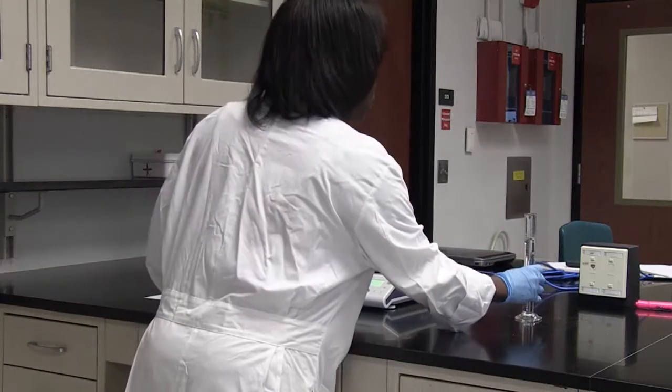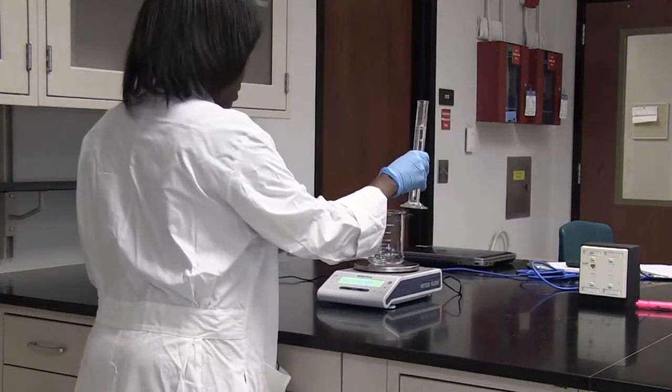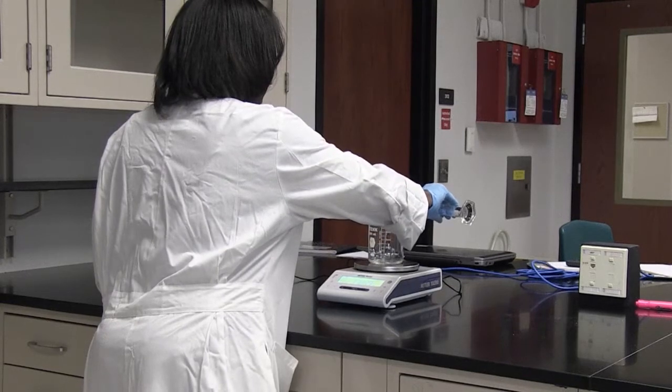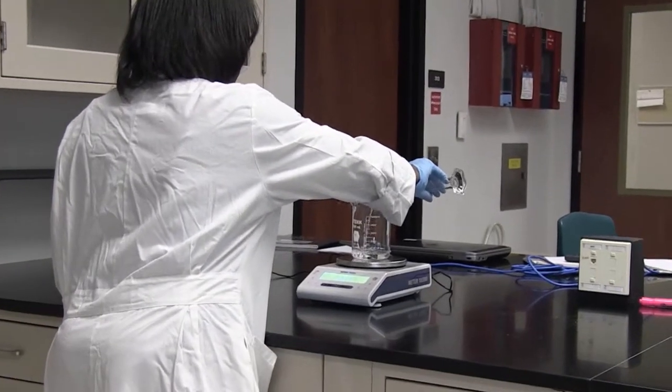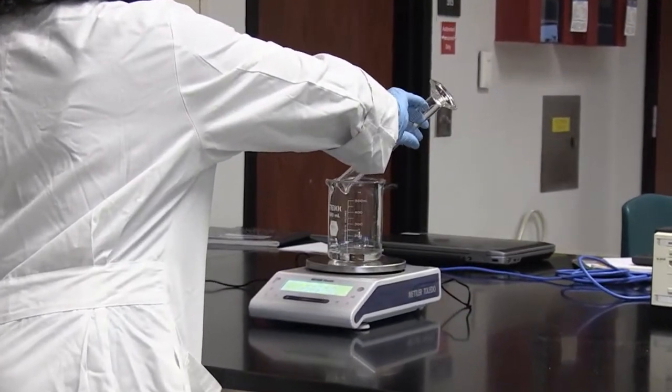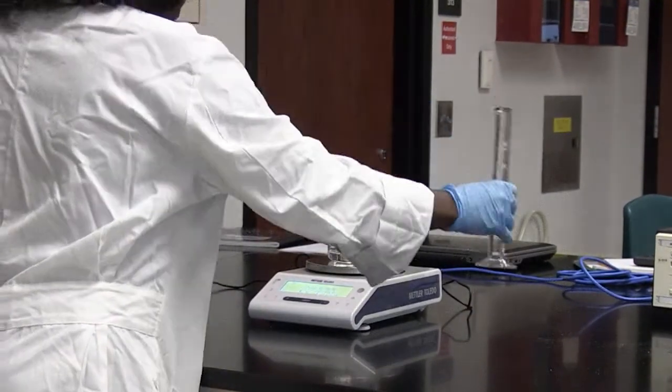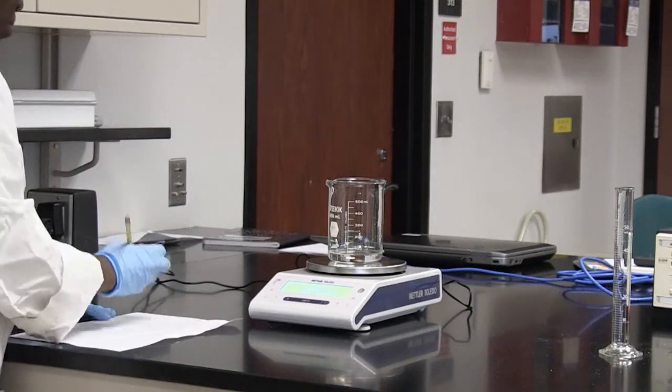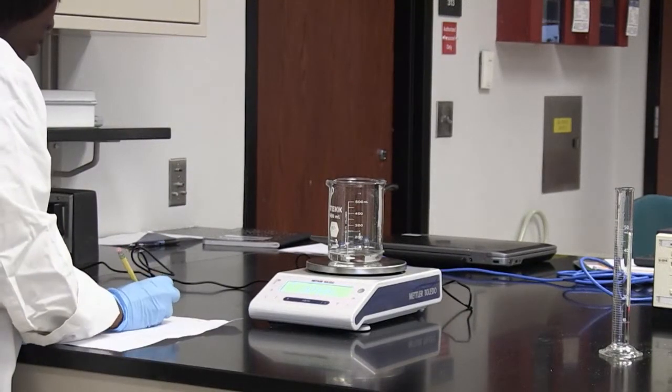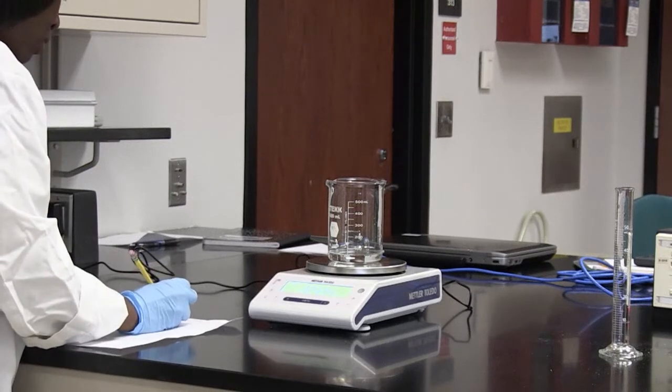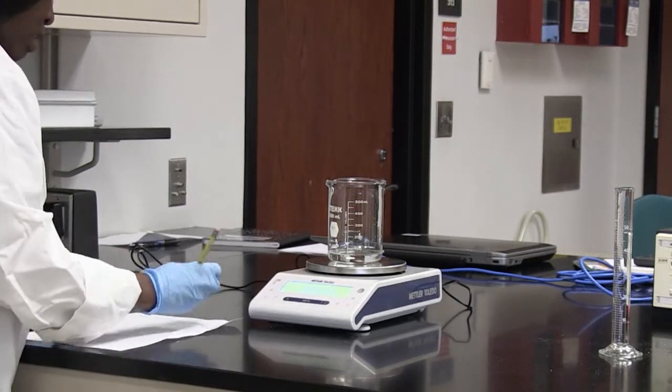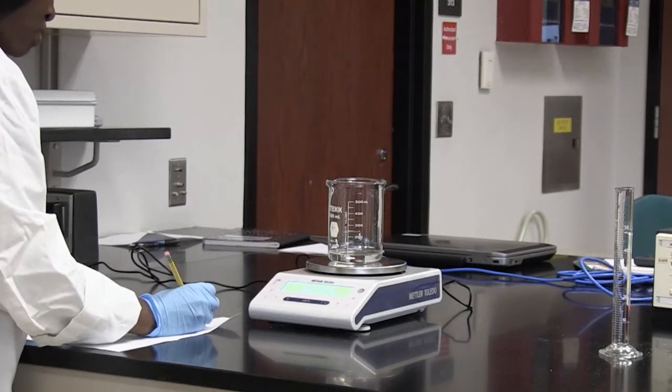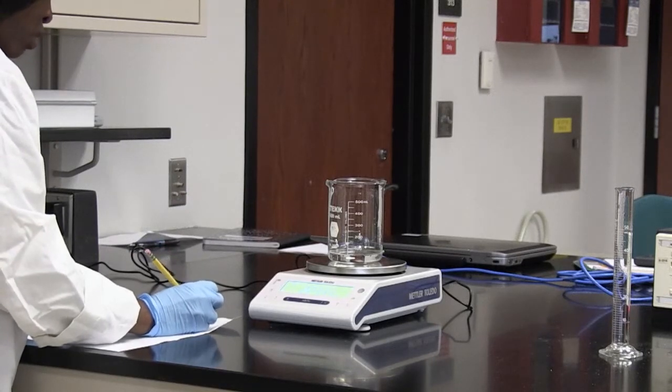Then I'm going to pour 50 milliliters of water into my beaker. And then I'm going to determine that weight. So the mass of the beaker plus water is actually 223.33 grams.